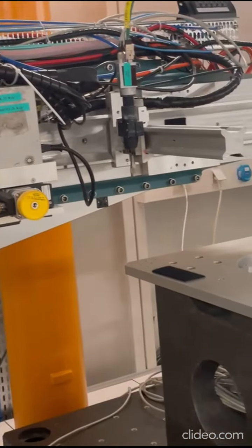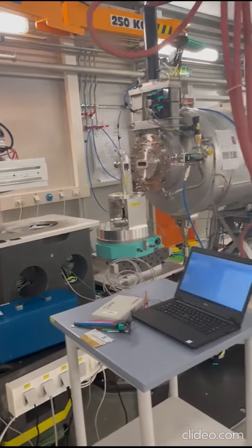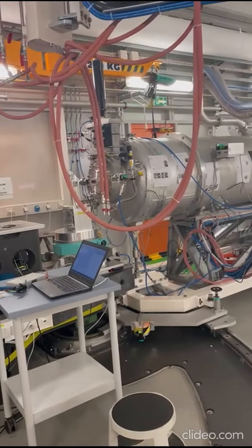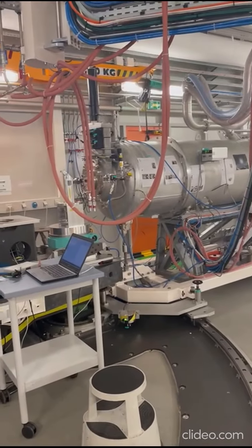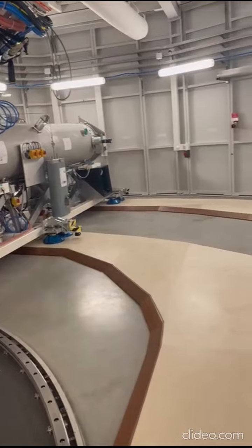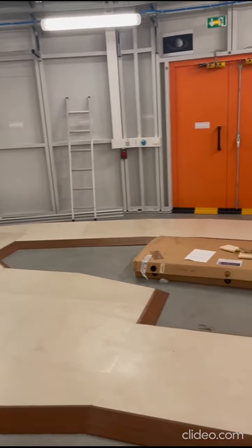Nanobeams aim to probe the smallest materials or to image materials in scanning probe mode. The diffraction patterns are obtained using the 2D detector. You can see the 2D detector here, and this is the platform where the 2D detector is rotated.